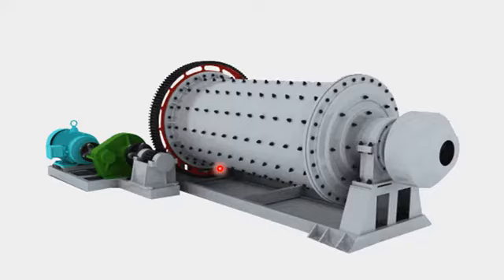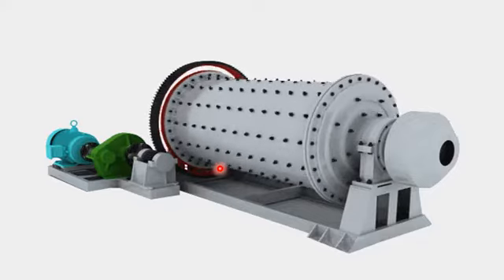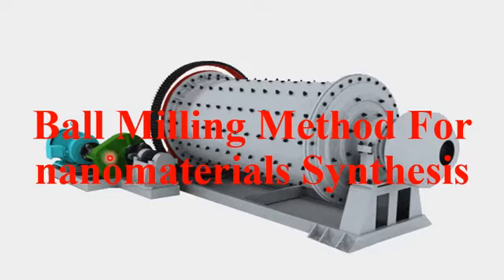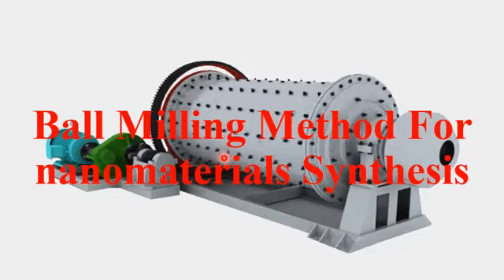So dear student, welcome to the lecture series of material science, nanotechnology and material science. So today I will briefly explain one of the very important topics, which is basically the start of nanotechnology. It is a top to down approach for the synthesis of nanomaterial, and it is known as ball milling or mechanical milling method for nanomaterial synthesis.